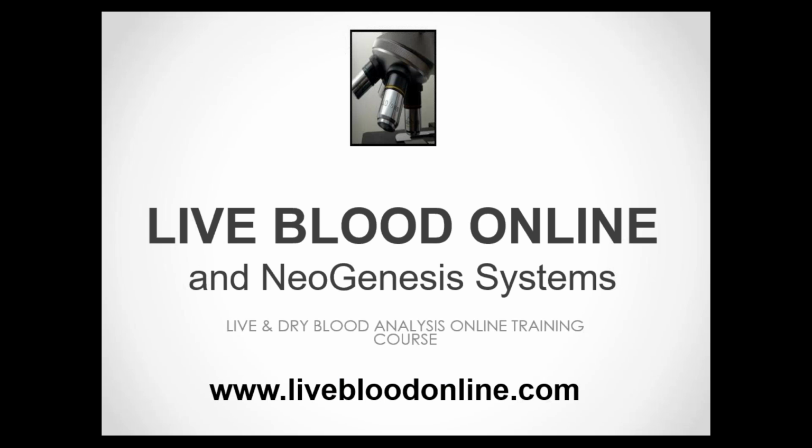So we get so many questions about choosing the right microscope for live blood analysis that we decided to put this webinar together where Dr. Okker, our course tutor and microscope expert, will really explain what is needed for live blood analysis. We realise that a microscope is a huge investment and this can put people off if they don't feel confident that they're making the right choice. So I'm going to be asking Dr. Okker some of the most common questions as well as some of the questions that you have submitted.